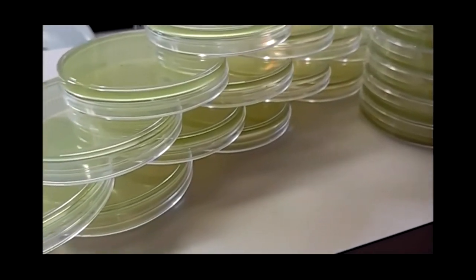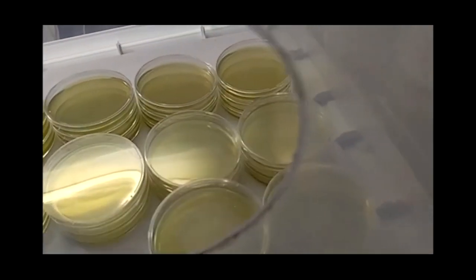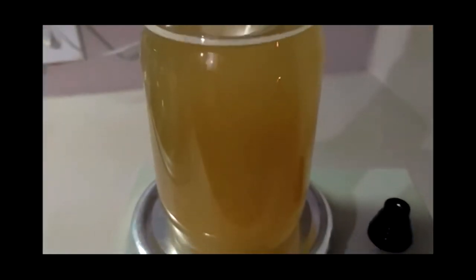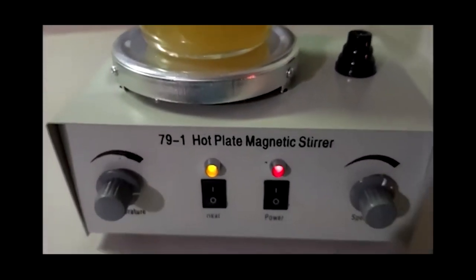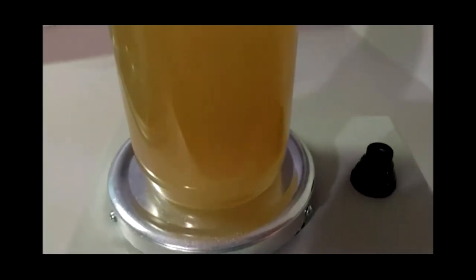MEA, or malt extract agar, is the go-to agar recipe for home mycologists. It provides the perfect adjustable recipe for growing out contaminant-free mycelium cultures. The great thing that we have discovered with malt extract is you can adjust the amount of nutrients and dextrose according to how much you want to feed your cultures. We started with a standard 10 gram agar, 10 gram malt extract per 500 milliliters of purified water and definitely got quick tomentose growth, but it was hard to determine what was good mycelium and what was possible contamination.